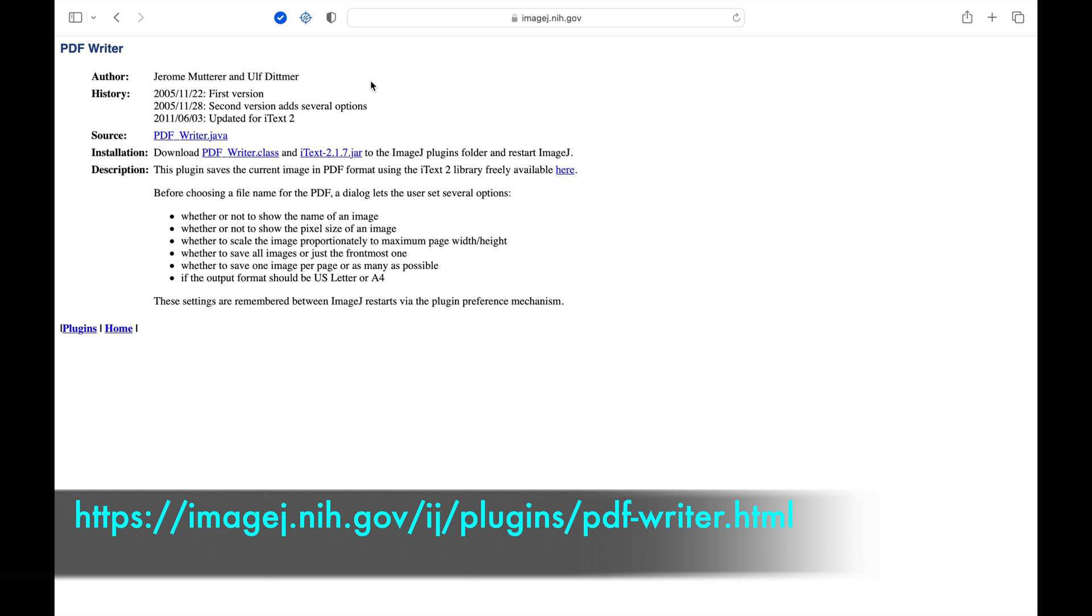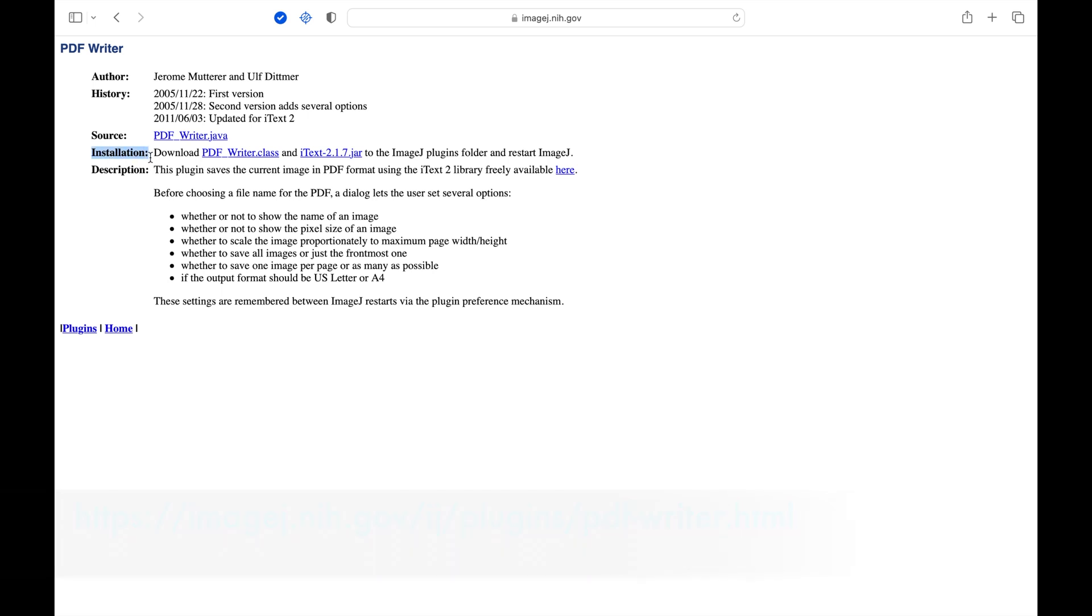In this webpage, the instructions suggest to download and install two plugins, namely PDFWriter.class and IText.jar.